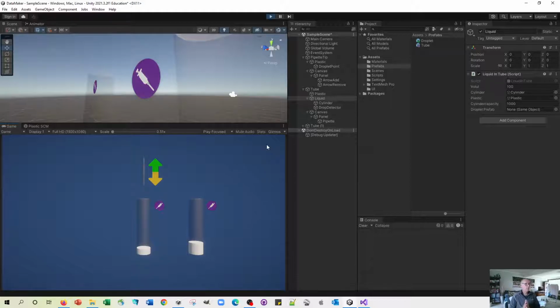Okay, so that's quite nice. We've got a bit of flow now. We're able to direct the pipette. We're able to actually have our controls on the pipette. One of the things that I've introduced here is this idea that the addition has this intermediary droplet. And that's something that we've used in the data generator since its inception, but it may well turn out that it's not necessary, that it's a middle step that isn't quite required. So in the next session, we'll see what happens if we don't use it. Because of course we didn't use it for the sucking up, did we? We didn't have a droplet for that.